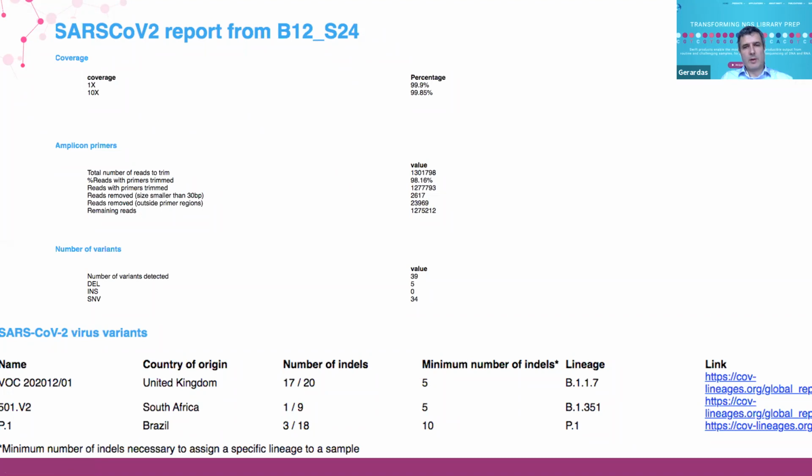So this is a little bit early days, but they're already perfecting the software. Hopefully in the next release, it will have a better graphical output. But what it definitely does is report the variants. There's a command line already built in. So this is a separate company, Phylogeny, that has this tool, and they are training the software with our panels.